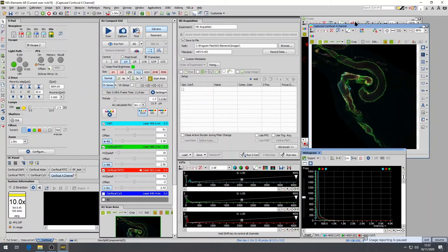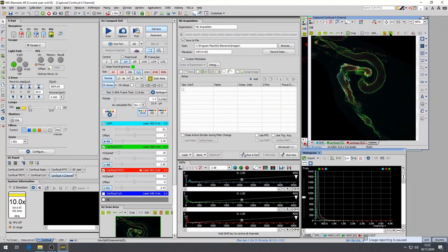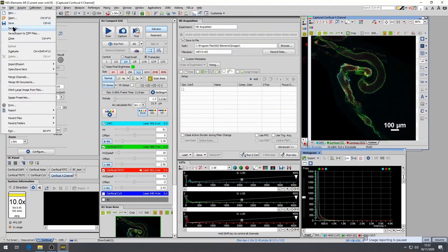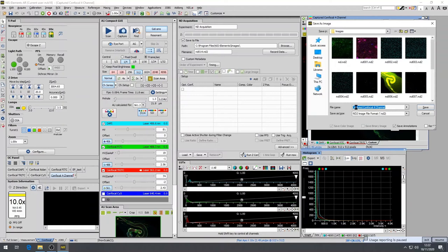Remember, captured images are not automatically saved. To save these images, you have to go to file, save as and save as ND2 file into your individual folder on the desktop. These images can be opened with ImageJ and NIS Elements.